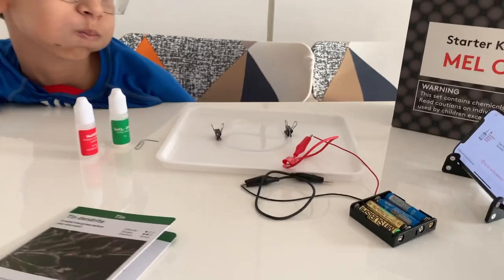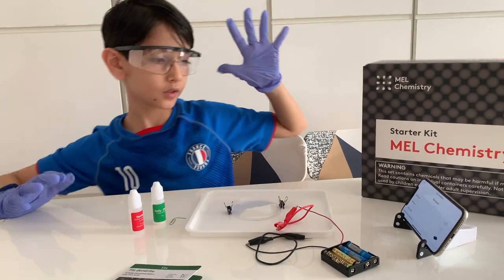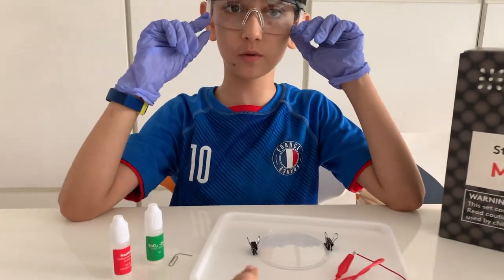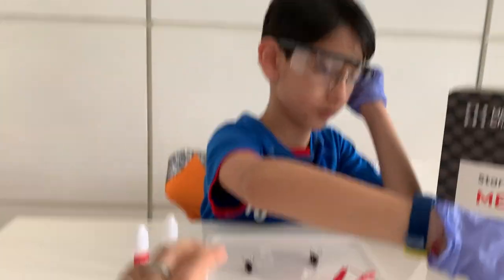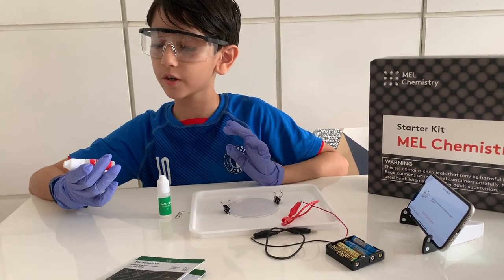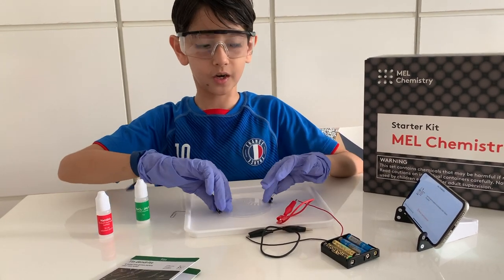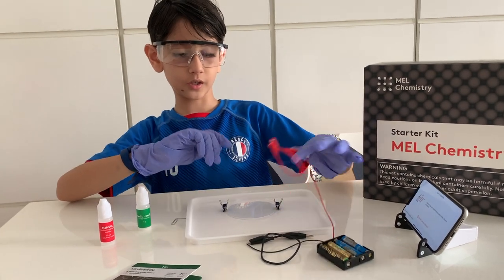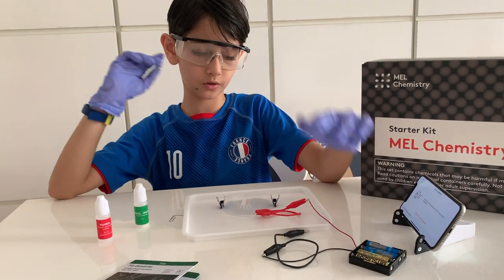So what all do we need? Can you tell? Let's see. Safety goggles, nitrile gloves, a safety underlay — which we don't have, so we are using the tray. And then we have sodium hydrogen sulphate, tin chloride, a dish, clip-ons instead of springs, a connector, battery holder, and wires.